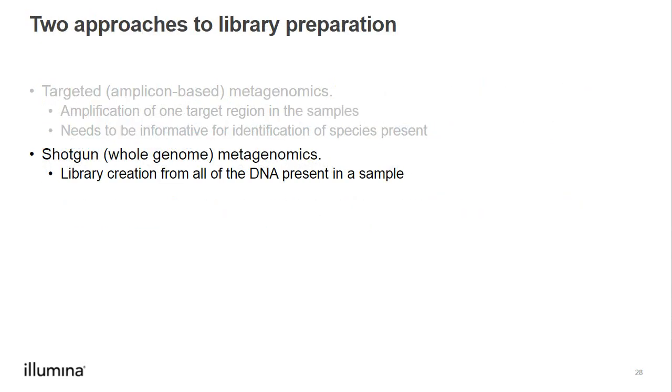We've reviewed targeted library preparation, so now we'll go ahead and take a look at shotgun metagenomics library preparation.